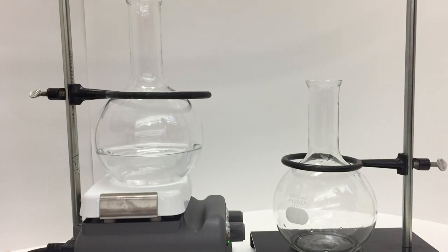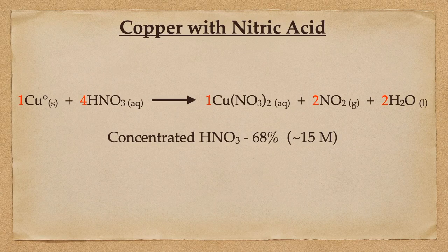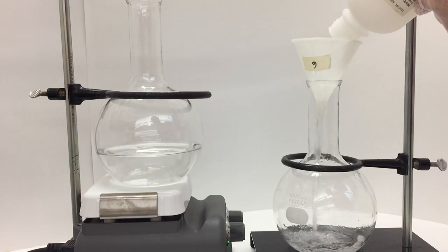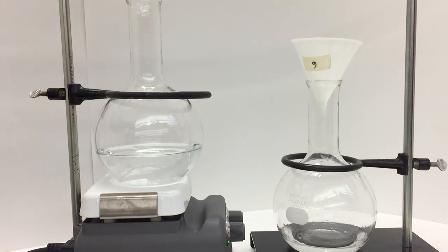We're going to take some extra precautions here. We've got ring stands so that the flasks cannot tip over. I've got some concentrated nitric acid which is 68% nitric acid, roughly 15 moles per liter, and we're going to use that to react with the copper. This is a very vigorous reaction that gives off gas.